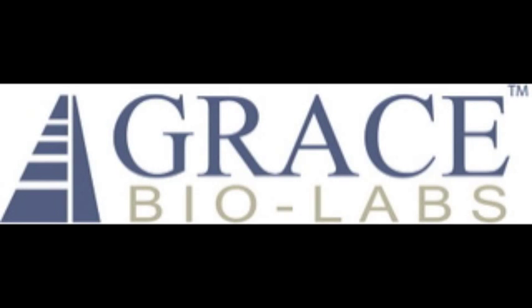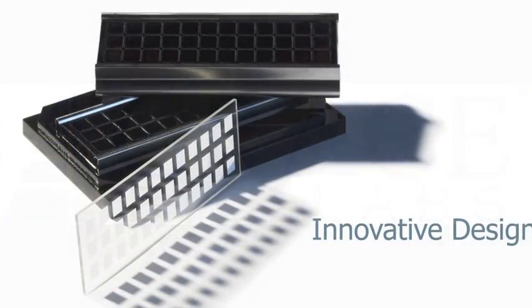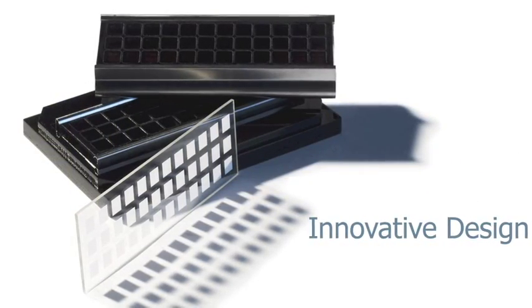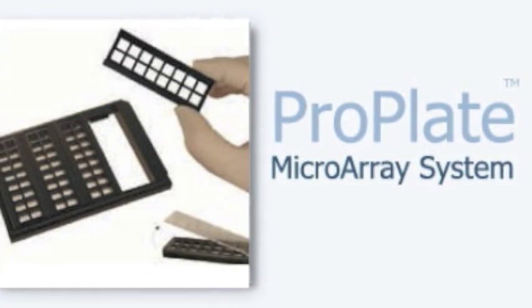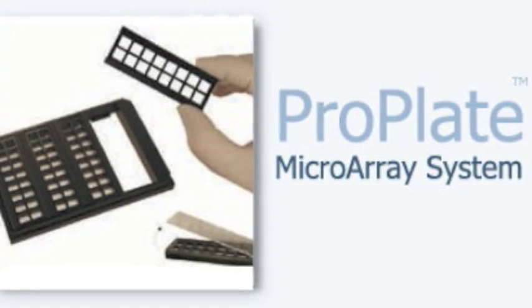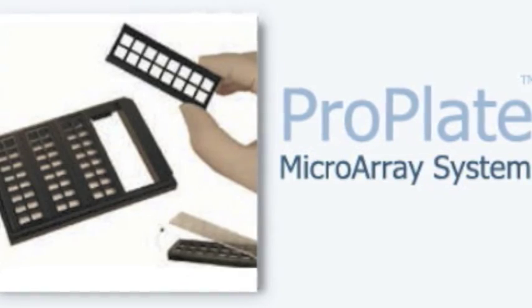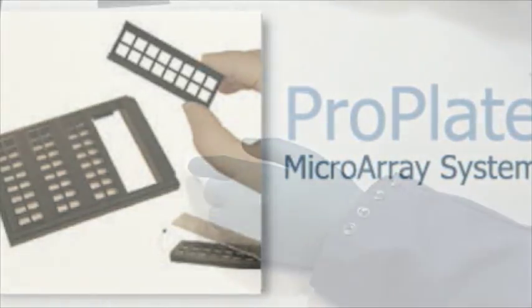Welcome to another video from Grace BioLabs. Grace BioLabs continuously strives to bring you innovative designs for molecular analysis. The ProPlate system is designed to enable active mixing during hybridization of standard microarray slides.